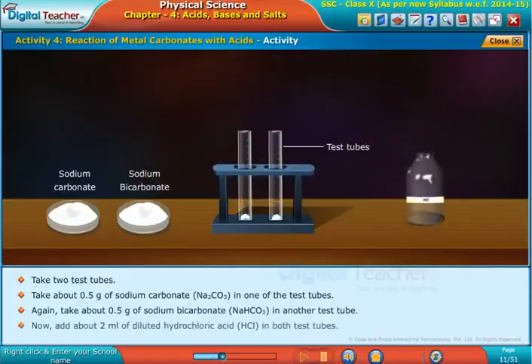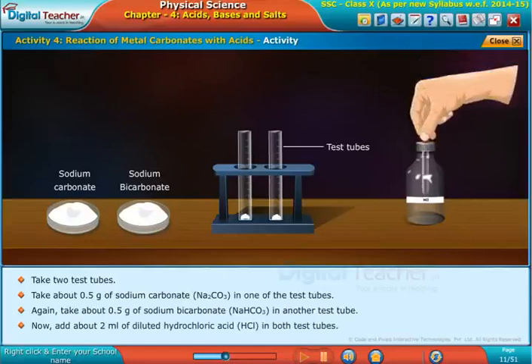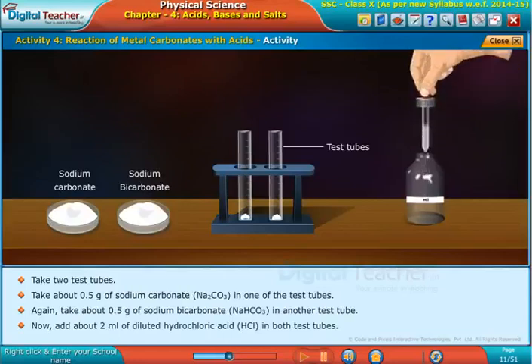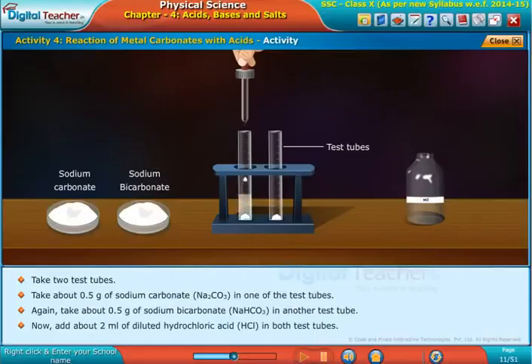Now add about 2 ml of dilute hydrochloric acid (HCl) in both test tubes.